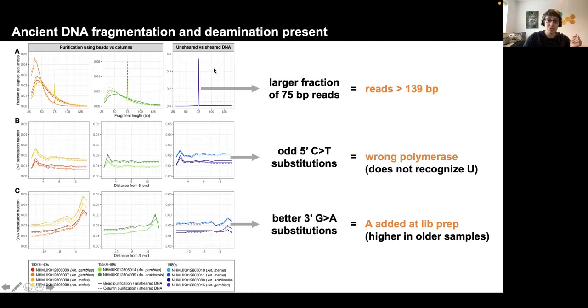And in the case of the really young samples, this is 50%. So we have really long DNA in there. Understandably, samples from, in this case, the 30s and the 40s have much shorter DNA and a much, much smaller 75 base pair peak.